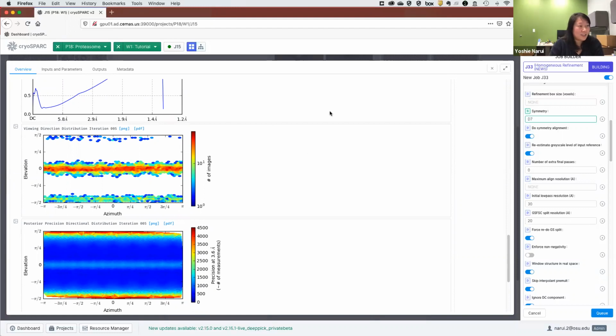You'd have to look at the data more closely. There's no hard and fast rule. I've also seen cases where people have a preferred orientation problem and then they try and fix it, and they get a different orientation problem, but that actually is enough information to build a model. So it may not be a problem if you can get it stuck in different orientations.